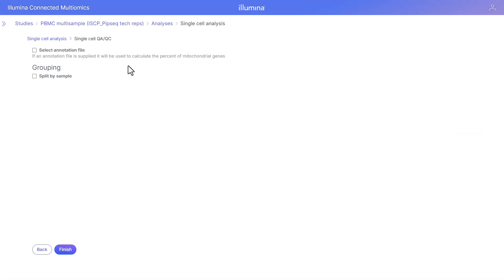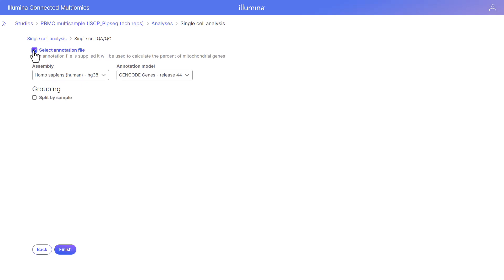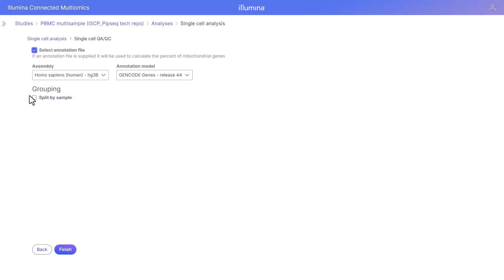We need to select the annotation file that matches the secondary analysis pipeline. In our case today, that's going to be HG38 — this is human data. For the genome assembly and annotation model, we're going to use the GenCode genes release 44. We have the option of splitting by sample, but for the purpose of this demonstration, we're not going to split by sample, and click finish.